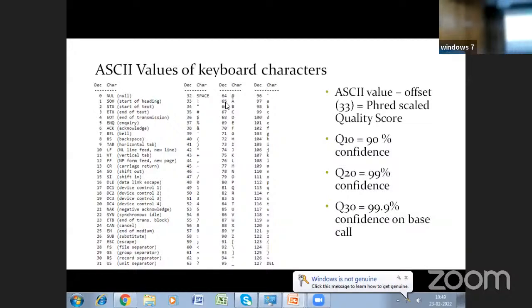Any other questions? Okay. As I mentioned, you should prefer Q30 reads when you go for NGS sequencing on the Illumina platform. Now we are pretty clear about what reads are and what the quality values are. Everything you will be doing in the practical.